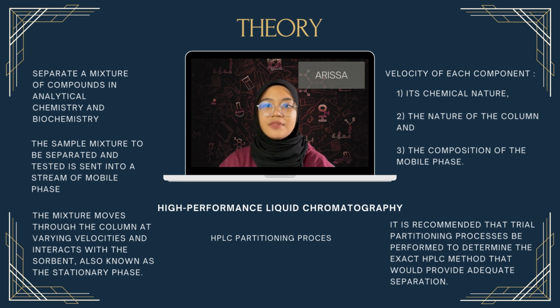The HPLC partitioning process is quite similar to the liquid-liquid extraction process, except that the former is a continuous process, unlike the latter which is a stepwise process. It is recommended that a trial partitioning process be performed to determine the exact HPLC method that would provide adequate separation.